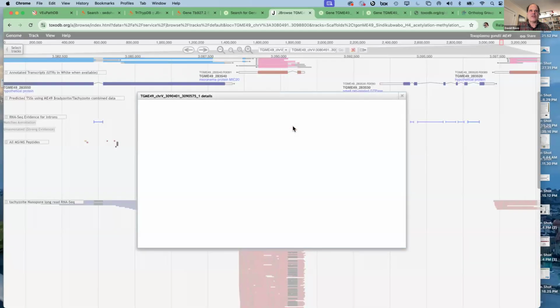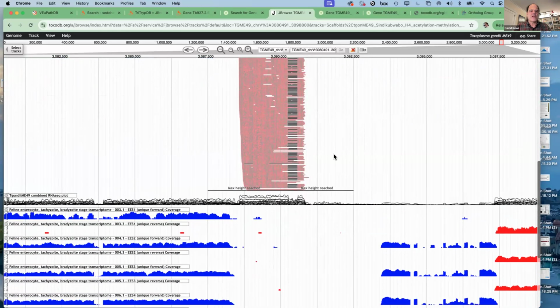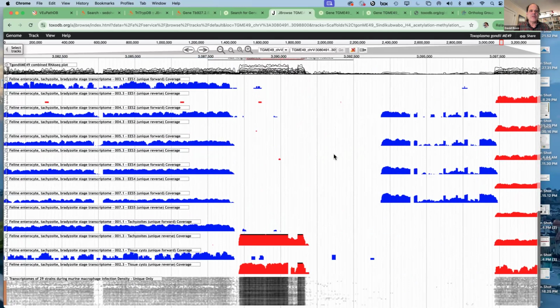And if we look at the length of those, this goes to location 366 and picks up at location 575. So that would be 209, in this case minus 1, 208 nucleotides. It would not be an in-frame protein coding sequence. So I am guessing that, so we can see evidence for that. This really is included in about 15% of the reads, but not across multiple different strains.